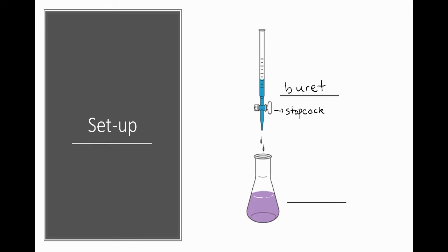Now, the flask at the bottom is specifically called an Erlenmeyer flask. The reason this is a good choice for titration instead of a beaker is because it helps prevent the liquid from the burette from splashing up on the sides, and it helps it roll back down into that bottom portion so that all the liquid is contained in one nice spot.